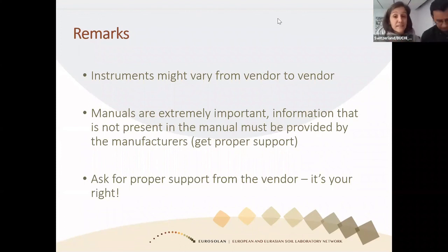So you have less information. And it's the same as for the NIR or MIR with this ATR accessory, because the sampling window is smaller, then you have less representation of your soil sample. I don't know if that answered. Thank you very much. Well, there is a remark, I think. You need a good representative sample for CNS. Yes. Okay.